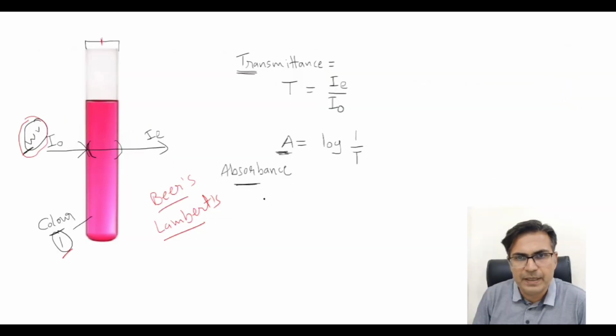By pressing 0 we have set transmittance to 100%, so it is in percentage.